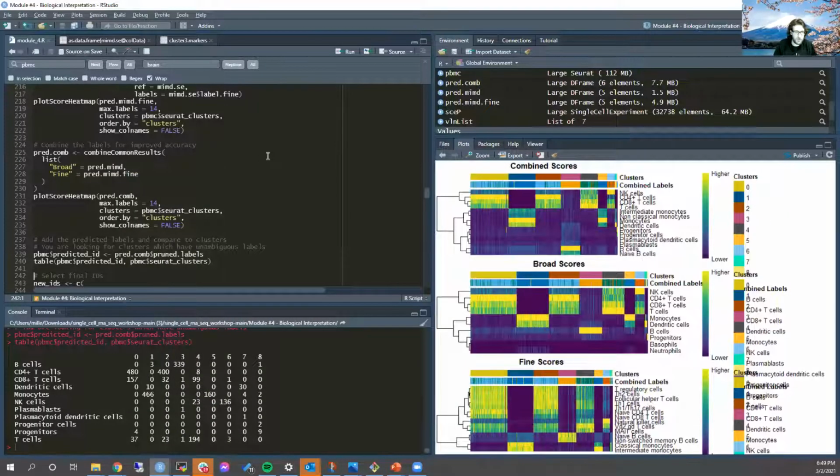So this is rough, and there's a lot of guessing and checking involved, but that's in many ways what the experience you have with single cell often is like. Ultimately, when you want to publish this, that's where you're going to really drill down and spend the time to absolutely justify every classification you made using literature sources and making sure you're doing it in the most robust way possible. But for a quick first pass through the data, this is totally acceptable. And hopefully by giving you these 3 strategies, you will be able to combine them and come to a pretty satisfying cell type annotation for your clusters.